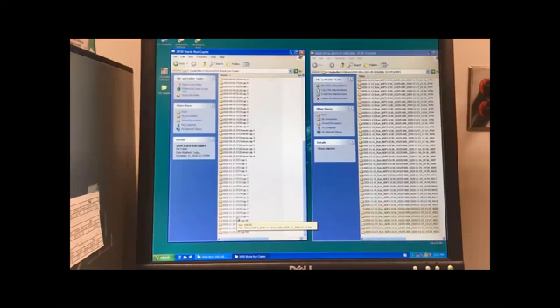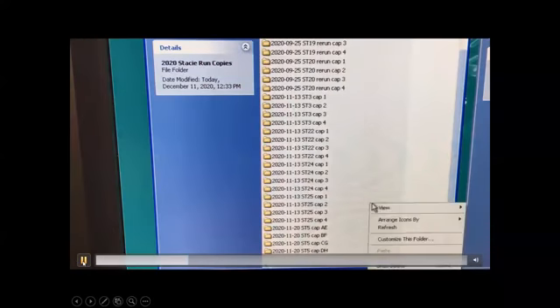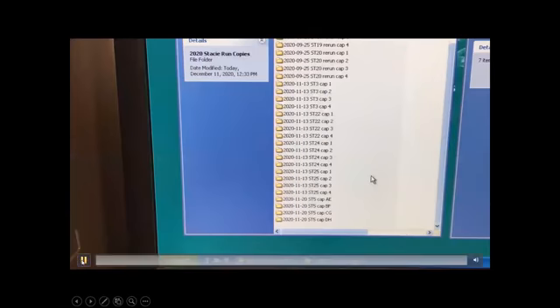All right, so let's see how this is going to go. All right, so we can see here Stacy has the 1120. But I want to create some for 1123. Notice we did it a little bit different. This is how I want you to do it. So you're going to left click, you're going to hit new folder, which I guess is in the next slide. You're going to right click here.